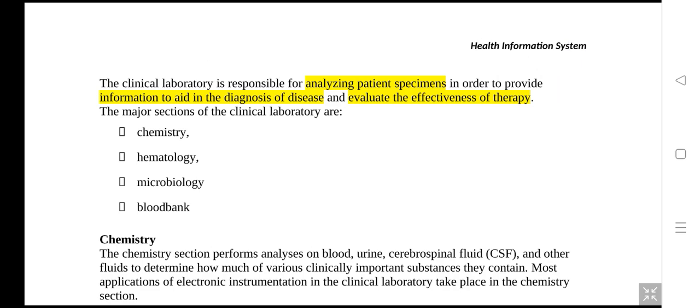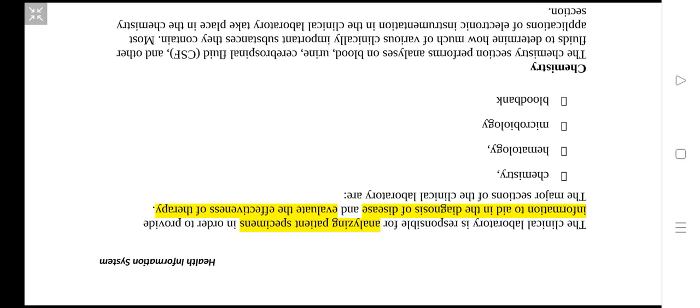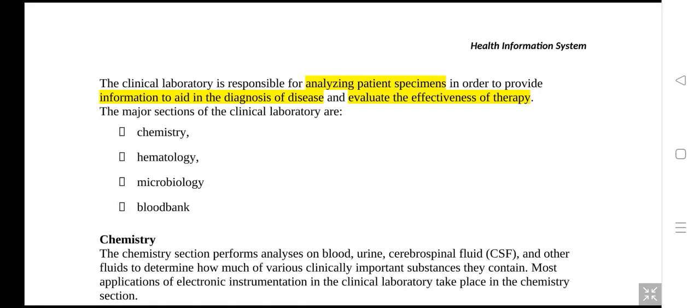We should begin with the extraction, because once you present that template of a request to the lab, the lab technologist or scientist will take that, and maybe you want to do some malaria test. A malaria test has to begin with blood, so somebody has to take a specimen of blood from the patient.